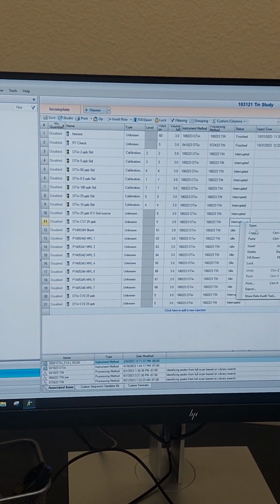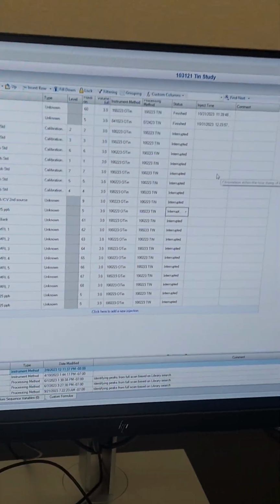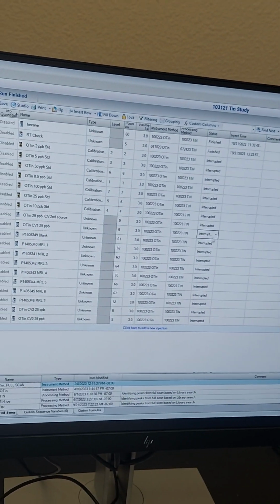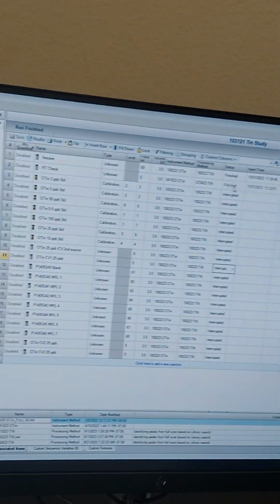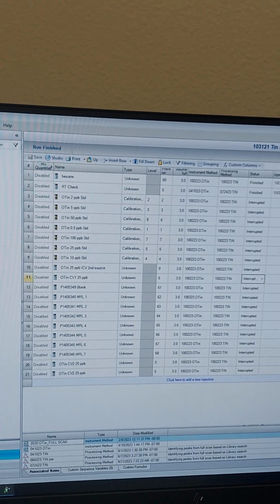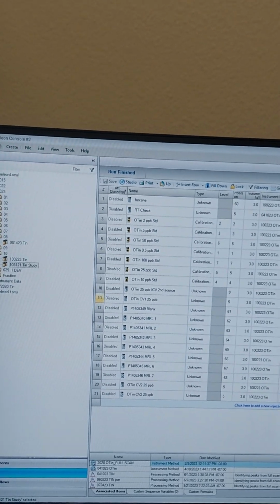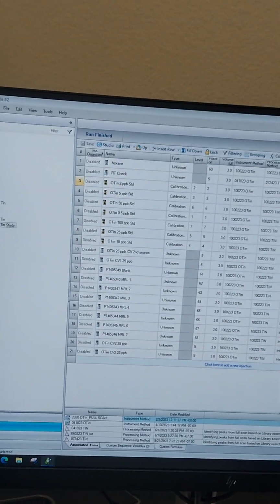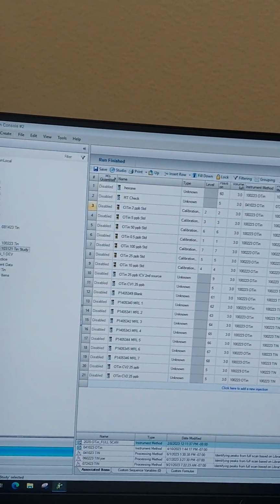So I'm going to make all these interrupted. Interrupted is the status. Yeah, interrupted means pause. So if it's on pause, idle, then finish is done. These also ran, do you need to put them interrupted or not? Which one? Oh no, those are done. Interrupted means it hasn't been done yet and it's paused. So you only do 3 to 21. No, I just finished these earlier today. I ran it at 11 and 12.